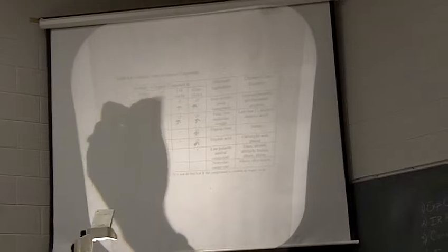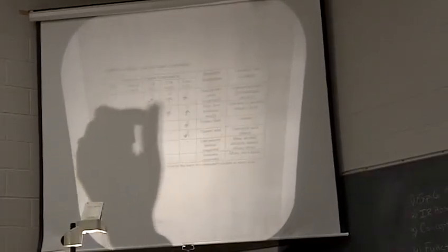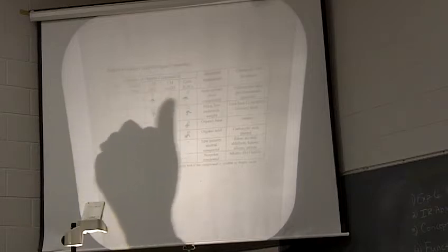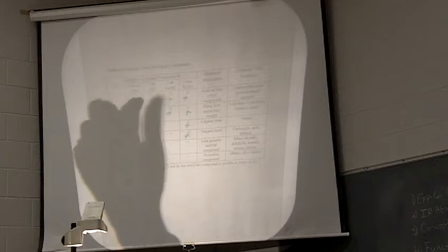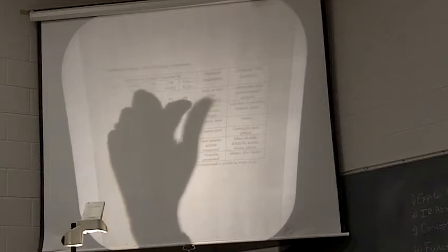And you're going to follow along depending on the trend you get and determine what functional group potentially is present, or functional groups. But you also want to follow this table. So for example, if you find that you have something soluble in water and not soluble in ether, you are not going to keep going, okay?